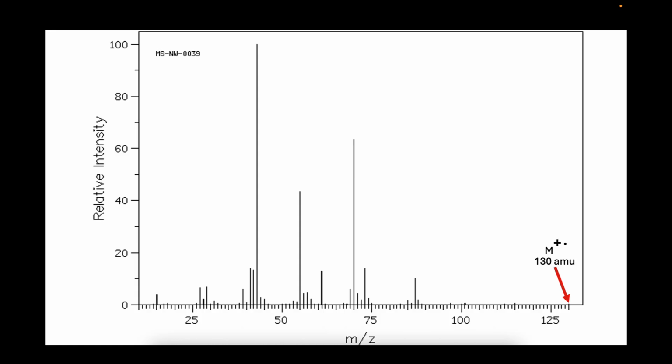But just realize that molecular ions vary in stability a lot. Some of them are strong because they're stable cations, some of them are weaker because they're less stable cations, and some of them, like in this case, are so unstable that they don't show up as a peak at all. They just disintegrate before they get to the detector. This happens to be the molecule isopentyl acetate. This is a molecule that's present in bananas and contributes to making bananas smell and taste like a banana.